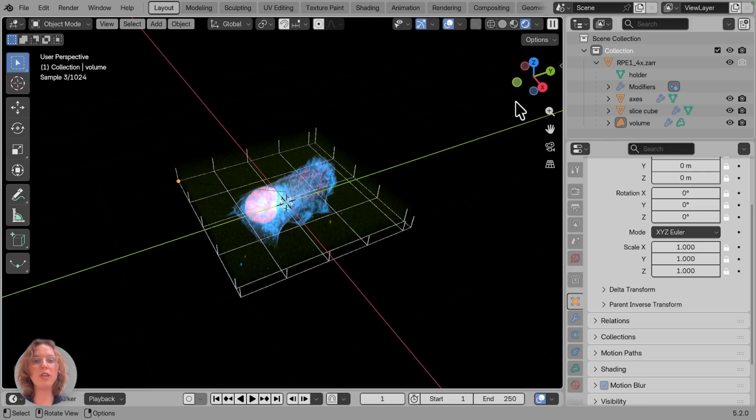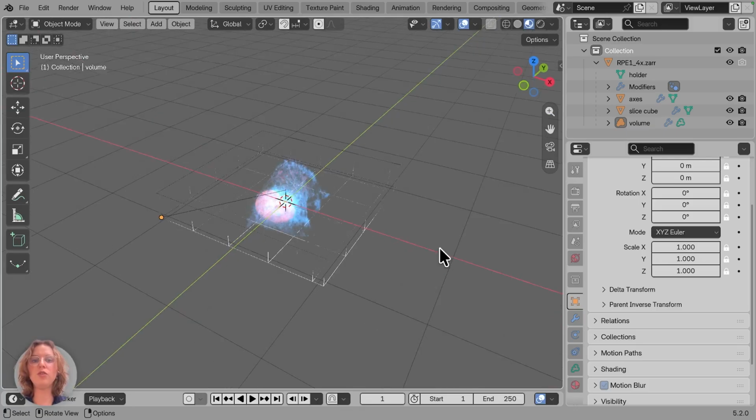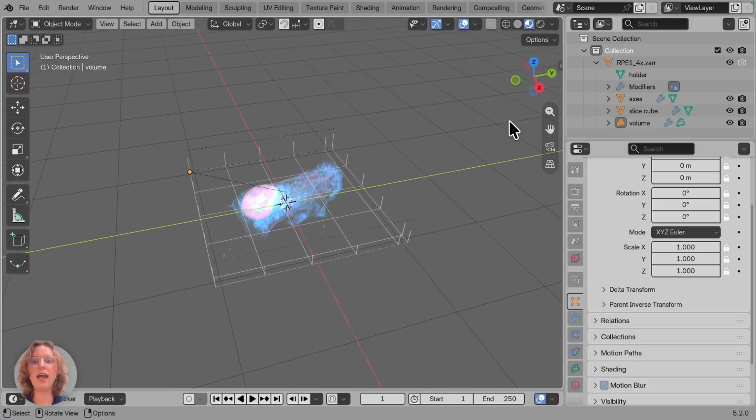The material preview normally uses Eevee and is useful for fast interaction. And the render preview uses Cycles, which is slower but supports more accurate ray traced rendering. Which one works best also depends on your computer, the data, and the kind of visualization you're making. So I would switch in between these two depending on your needs, and you may even want to change the render engine of Blender to Eevee as well if this is just much better for your data.